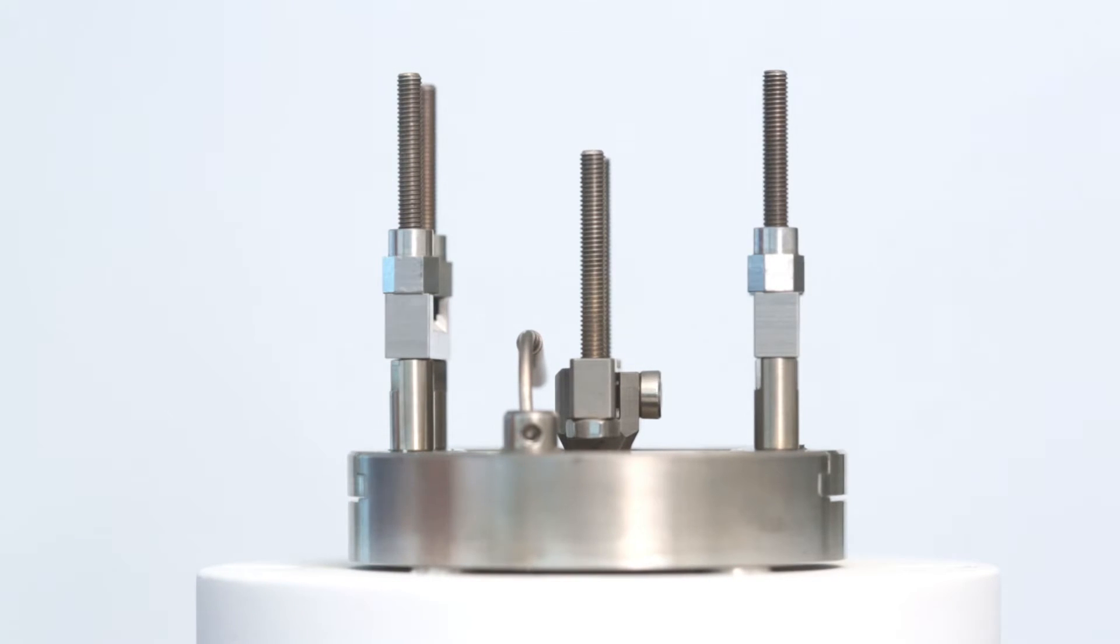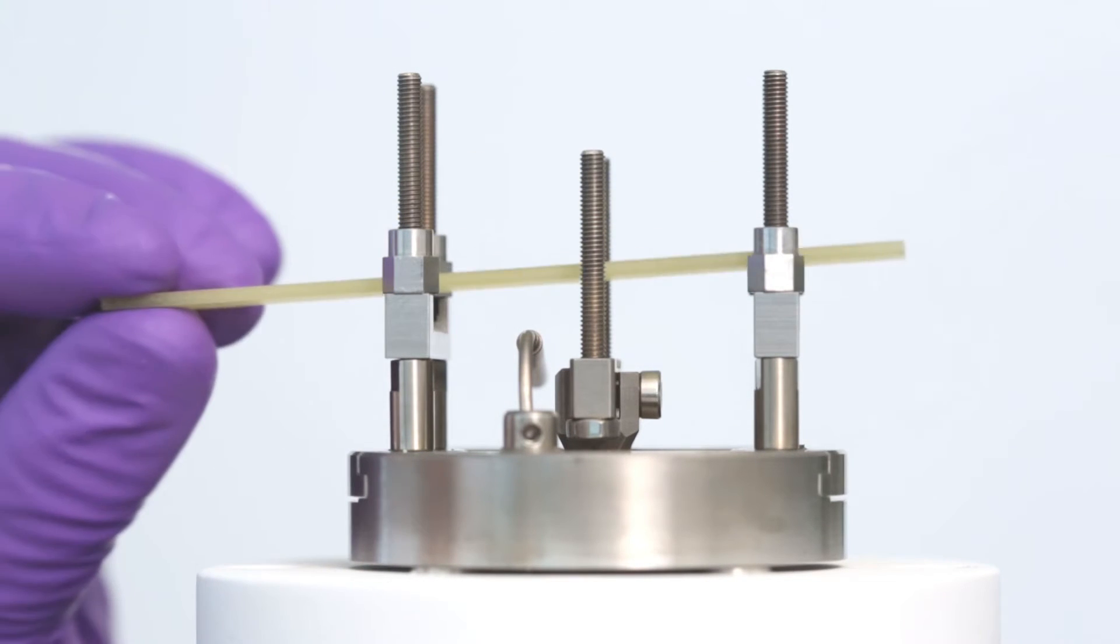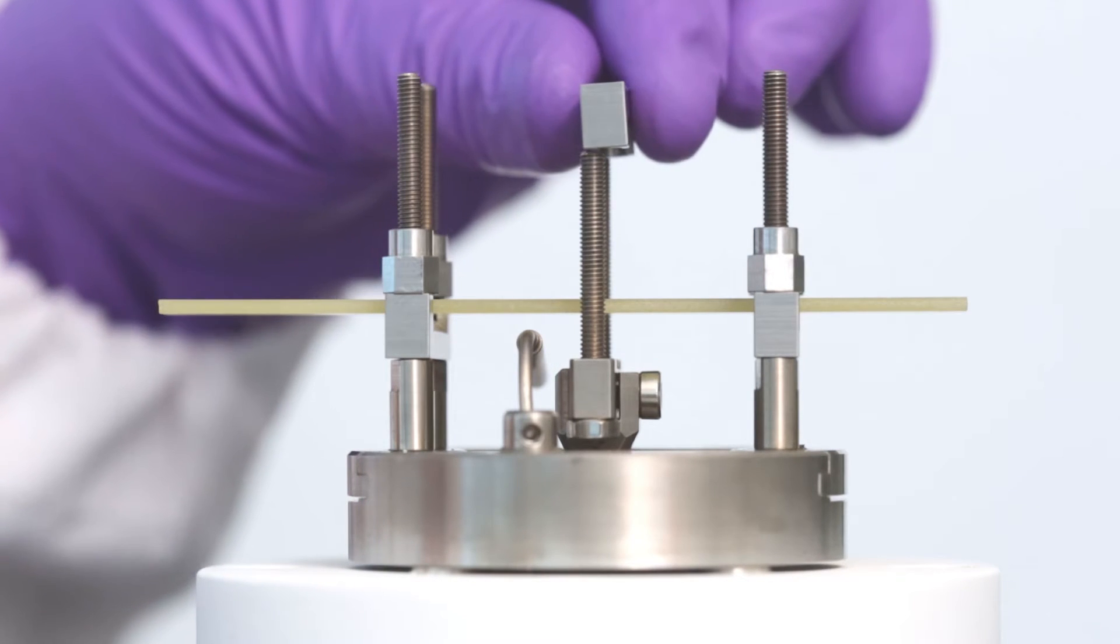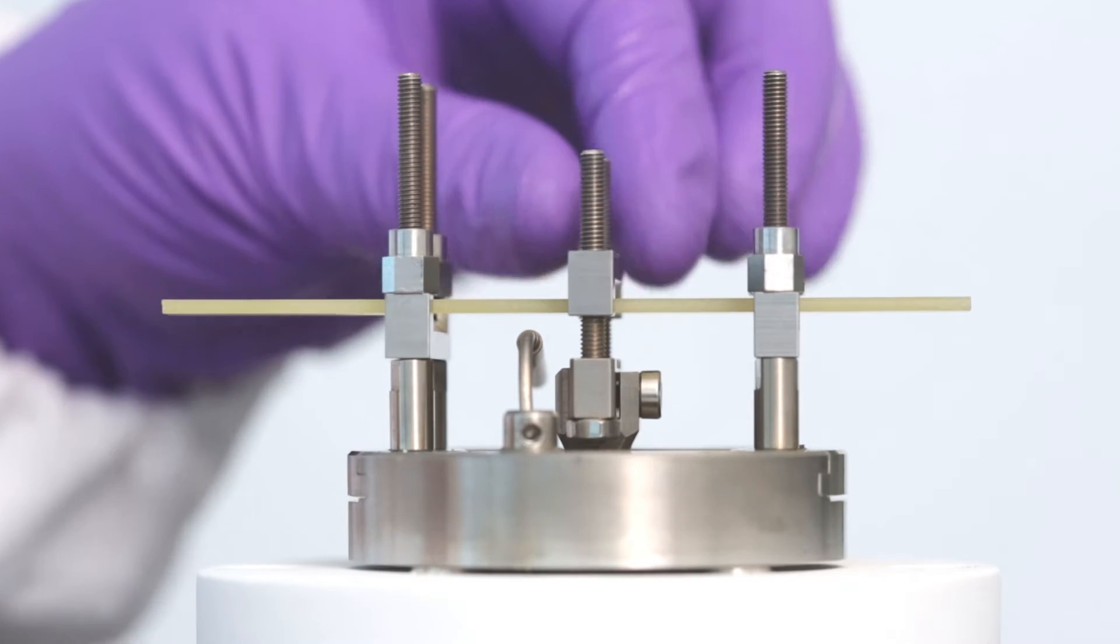Now, carefully place the sample in the 3-point bending clamp. Once this is done, we can fit the middle clamp bar with the V-shaped edge facing downward.